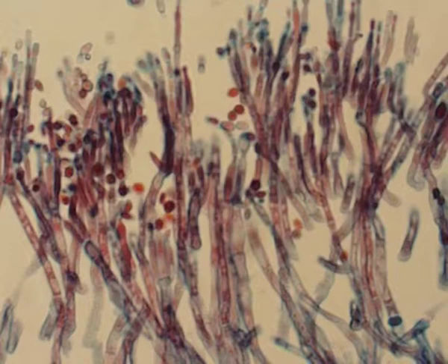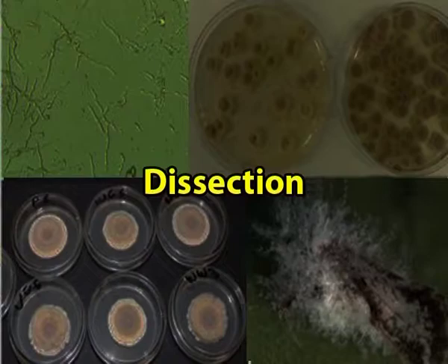In this case, the removal of spores from the tips of conidiophores is accomplished by touching the most distal spores to a minute amount of sterile media on the tip of a sterile pin and then inoculating an appropriate medium in a petri dish.